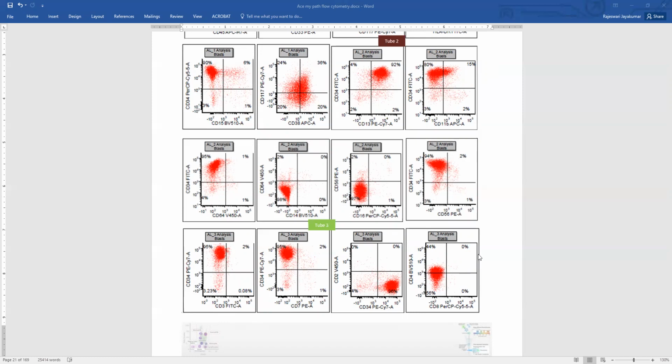But here we don't think it is T-ALL because it looks like it's only expressing myeloid markers so far. Also, T lymphoblasts always express CD7, and here CD7 is negative, because CD7 is one of the earliest markers that appear in the progenitor cells that are committed to T lineage. Even in the pro-T cells that are in the bone marrow, CD7 expression is positive. So CD7 will be positive in T lymphoblasts. So here, if you're not suspecting that, you don't have to add your cytoplasmic CD3.